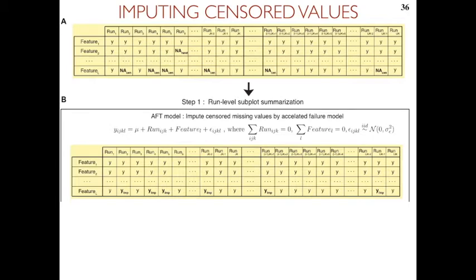Yes? Okay, so for this model, when you say it's below the limit of detection, is it completely undetected, or is it just below the limit of quantification, or it doesn't matter? Well, there are two ways to answer it, right? If you work with targeted assays, you actually characterize the assay in terms of limit of detection, limit of quantification, limit of blank, and all of that. So this is one way to proceed. If you work with assays which have really good characterization, you can actually select this threshold based on what you know about the assay.